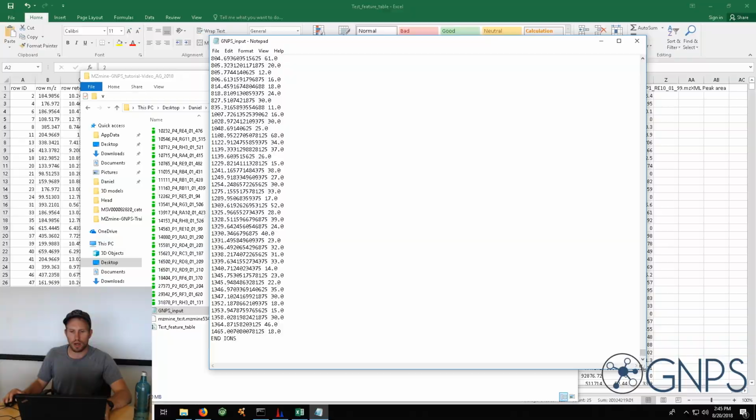So how you're going to upload those files now into GNPS and how you generate your networks, this we will cover in the next tutorial.